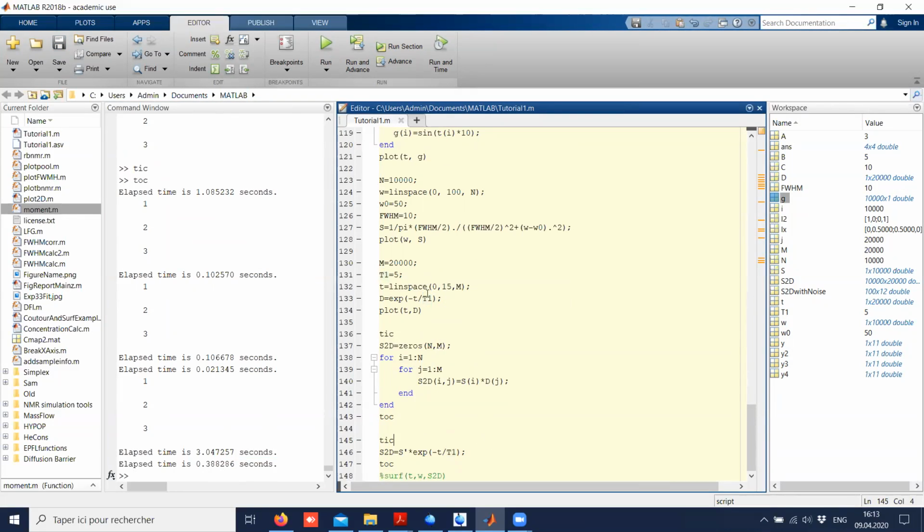And if you increase, so now it's only 2 dimensions, but if you go to high dimensions, the difference will be more and more pronounced. So this is the really appropriate way to do calculations in Matlab. When you can avoid using for loops, you do it, because Matlab is so well optimized to do calculations this way that when you do it like this, it's very slow. Of course, you will use for loops for special cases, but in principle, you don't do it for calculations like this.